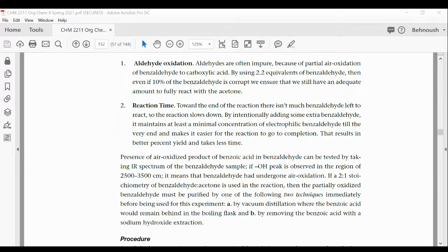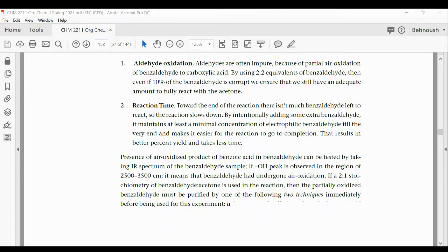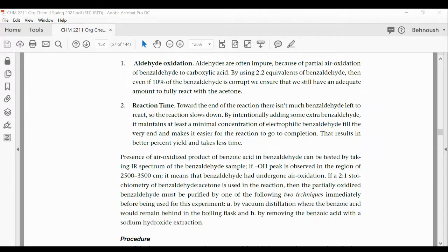And if it's 2 degrees off, it could be calibration of the thermometer, or it could be minor impurity of any sort. It could be leftover of one of the reactants, or the sample is not 100% dry. Since it's that close, you could just mention it as a minor impurity.